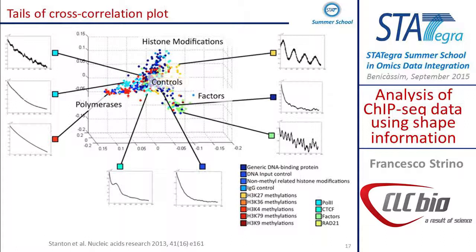The nice thing about histones is that, as I was saying, they wrap around about 150 base pairs, and you can actually see this pattern in the cross-correlation. All of these peaks will be more or less one histone distance apart. It will be a bit more than 150, about 170, because you have a linker. But you can really recognize that you have histones. This example is quite nice: it's K27 trimethylation. This mark is tightly packed, so you have a lot of histones next to each other, and you can really see the pattern very well.